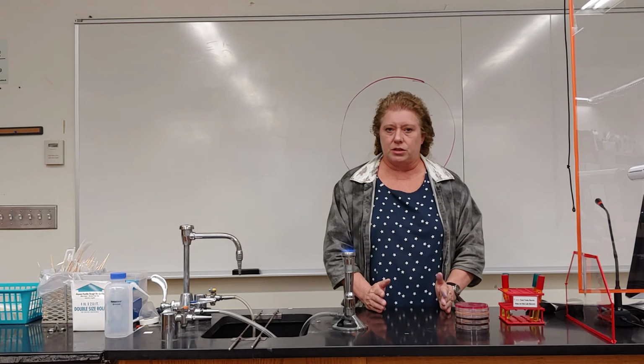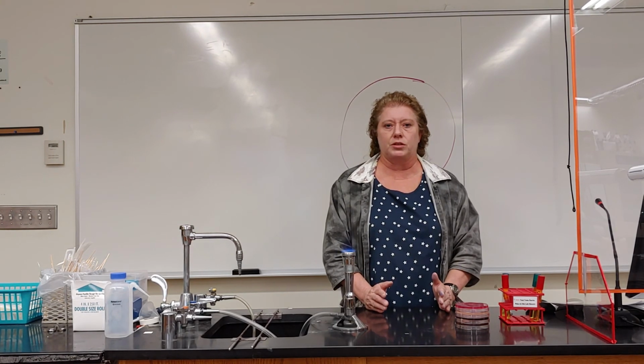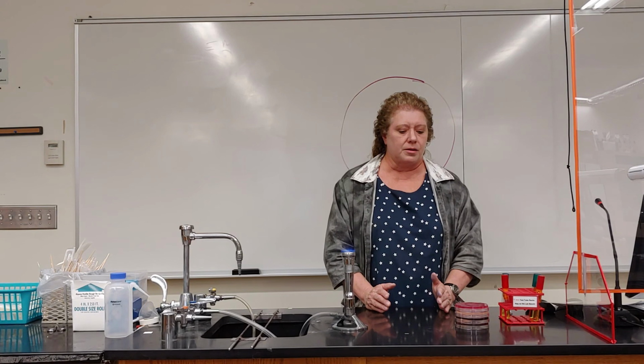And then we'll be reading the results of those plates, which will be posted so that you can see what they look like.